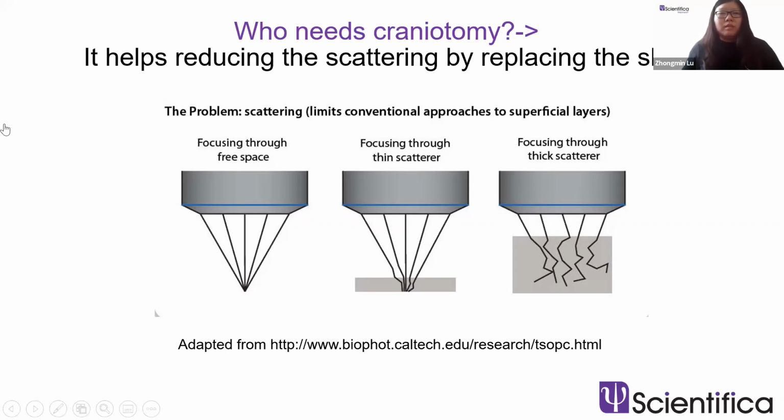And craniotomy surgeries, as well as other types of surgeries like GRIN lens implantation, require a lot of practice and patience. I have some tips to share, and we're also planning some workshops in the Asia Pacific area. So please talk with us after the presentation with your questions.